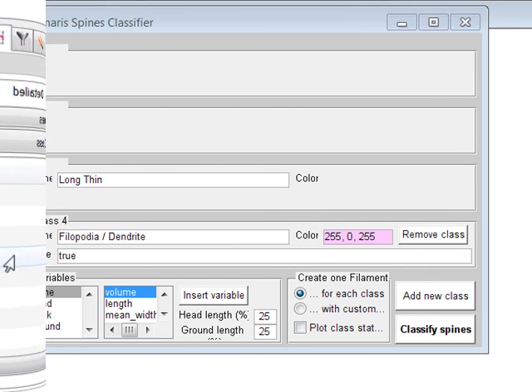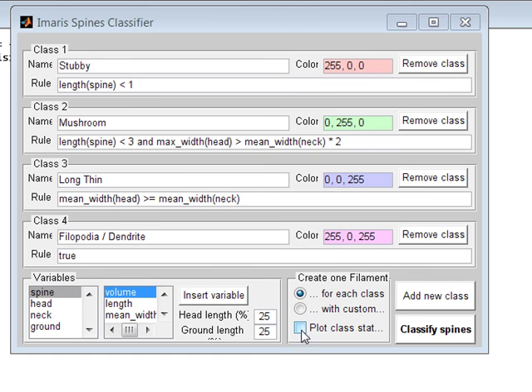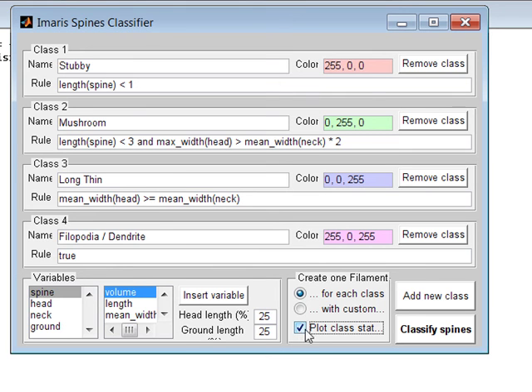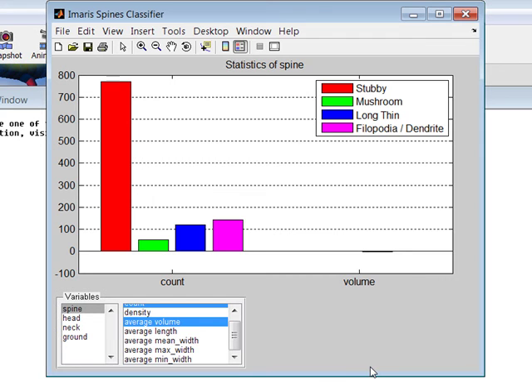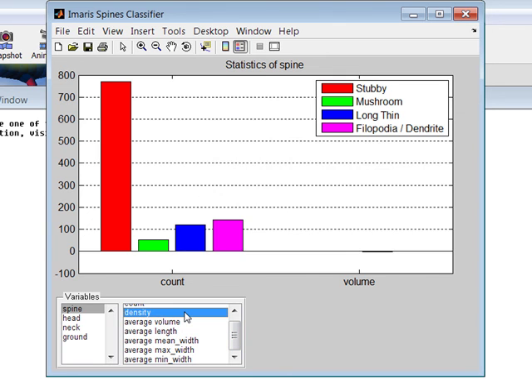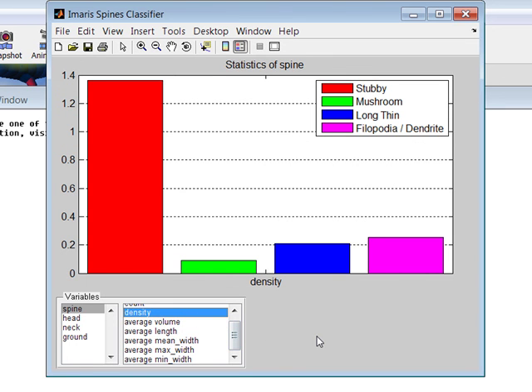Finally, the option Plot class statistics produces an additional window with interactive spine statistics plots. For each spine class, different variables can be plotted for the morphological parameters spine, head, neck, and ground. The one shown displays spine density for each spine class, plotting the total number of spines divided by the total length of the dendrite.